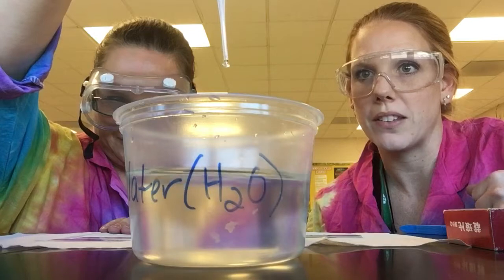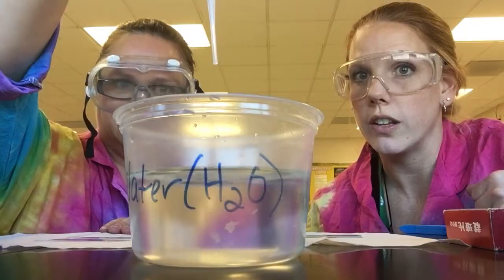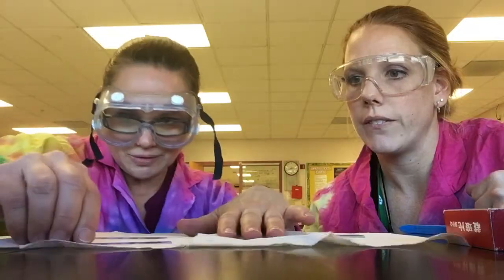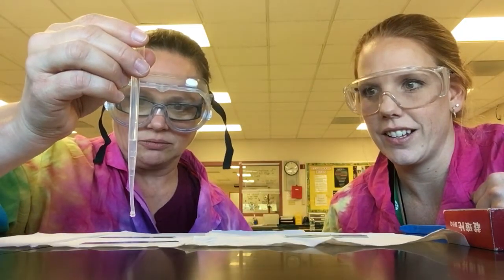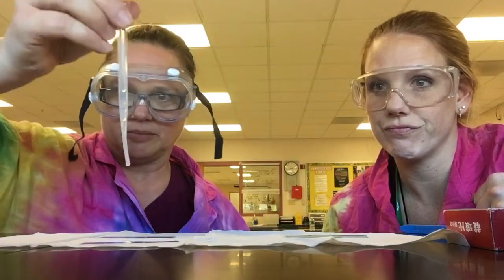You're going to need a drop of water on the slide first. One drop — and you always pipette straight up and down, never off to the side, because it would go right into your partner's eyes. Always straight up and down.